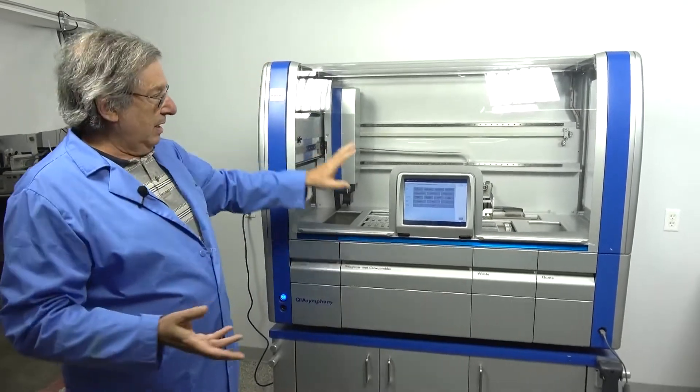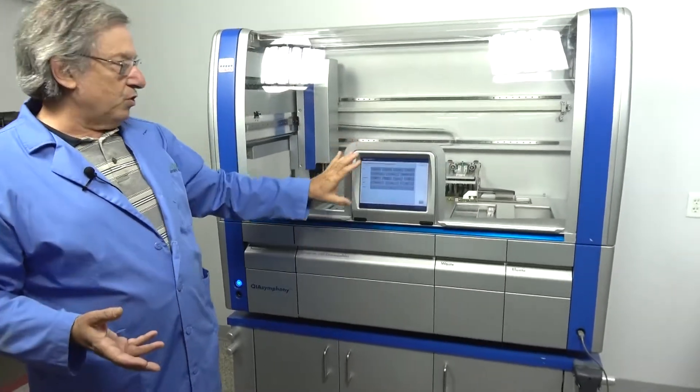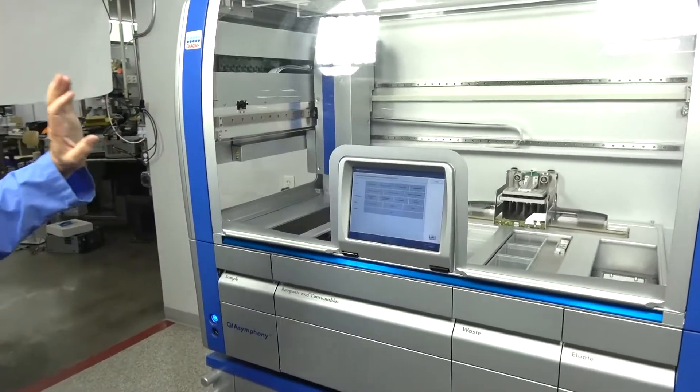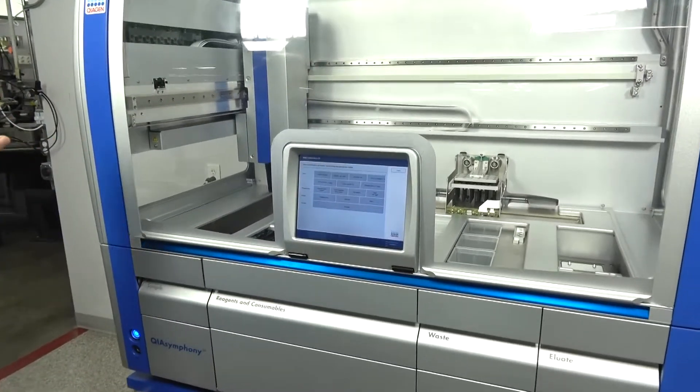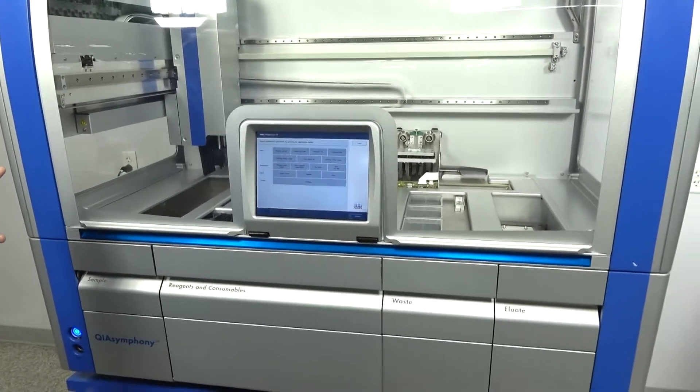The system comes with a touchscreen so it's really easy to operate. It uses a lot of consumables and we're going to talk about that in a bit.